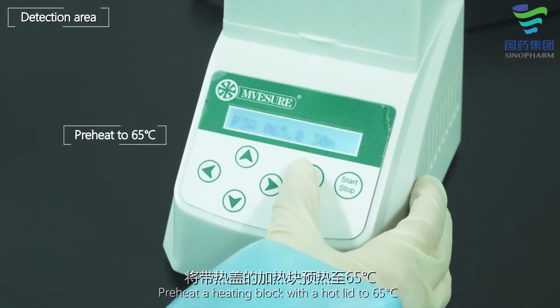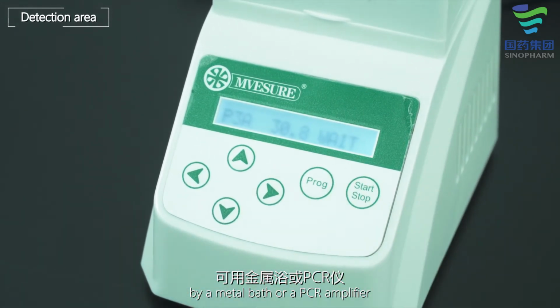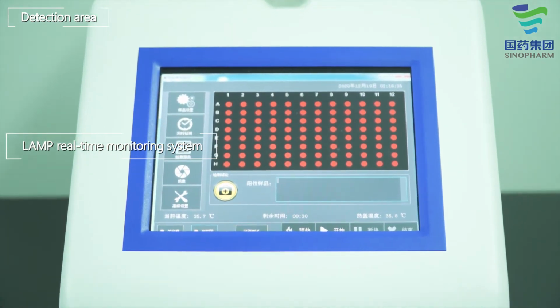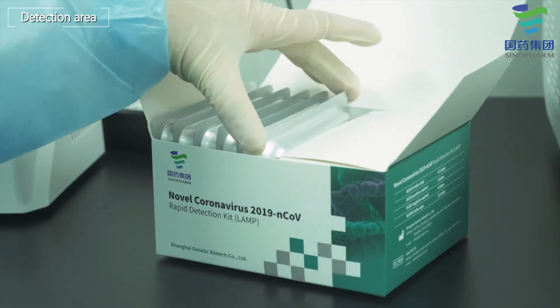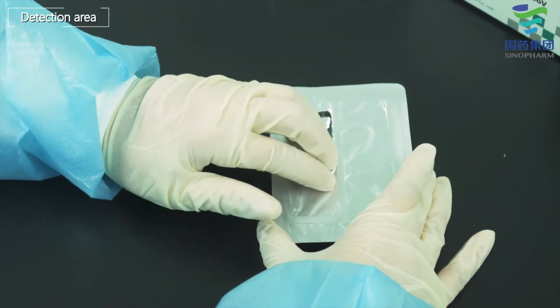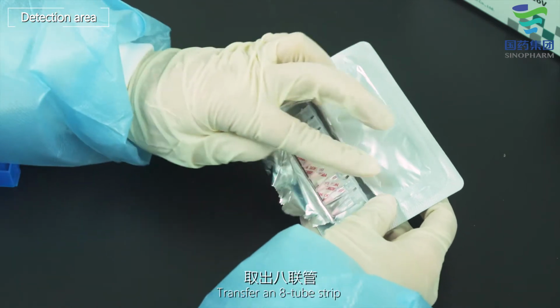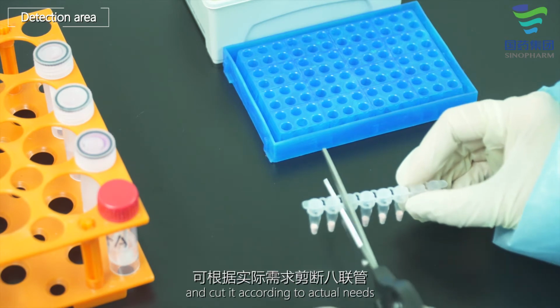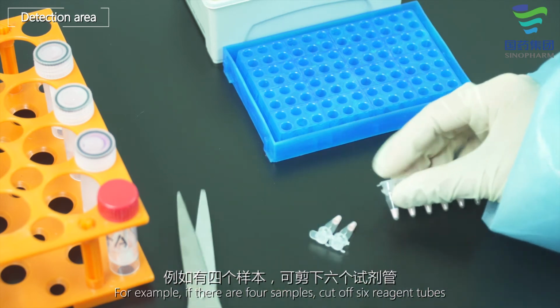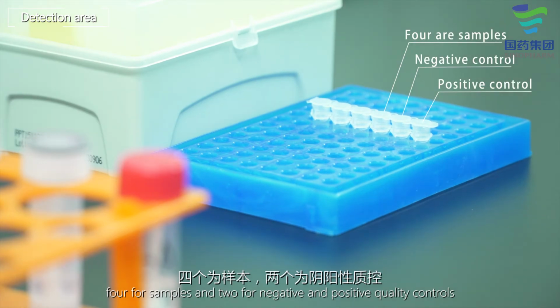Preheat a heating block with a hot lid to 65 degrees centigrade. Use a metal bath, a PCR amplifier, or a LAMP real-time monitoring system independently developed by GeneSC. Take an 8-tube strip and cut it according to actual needs. For example, if there are 4 samples, cut off 6 reagent tubes, 4 for samples and 2 for negative and positive quality controls.